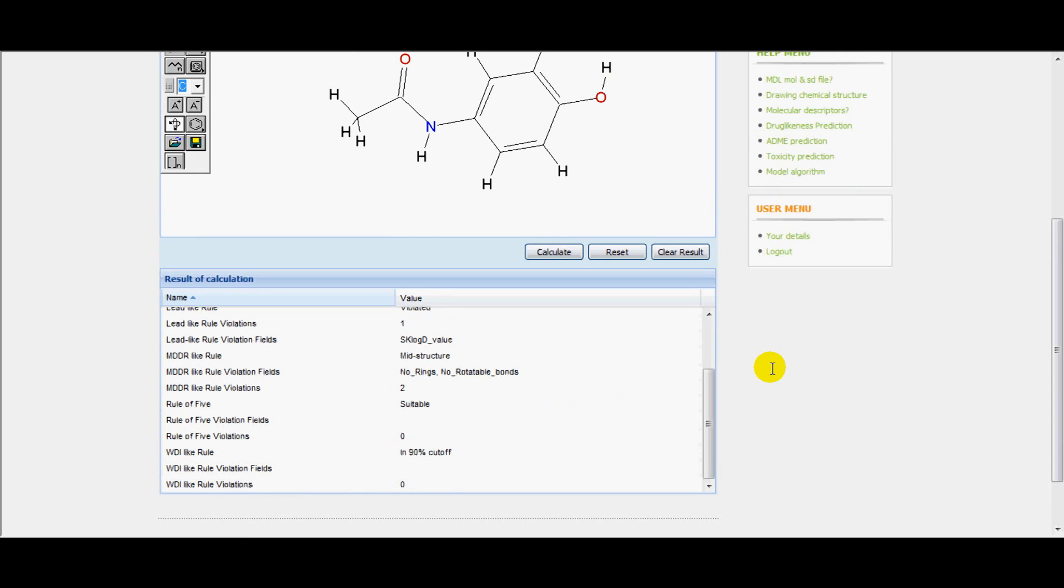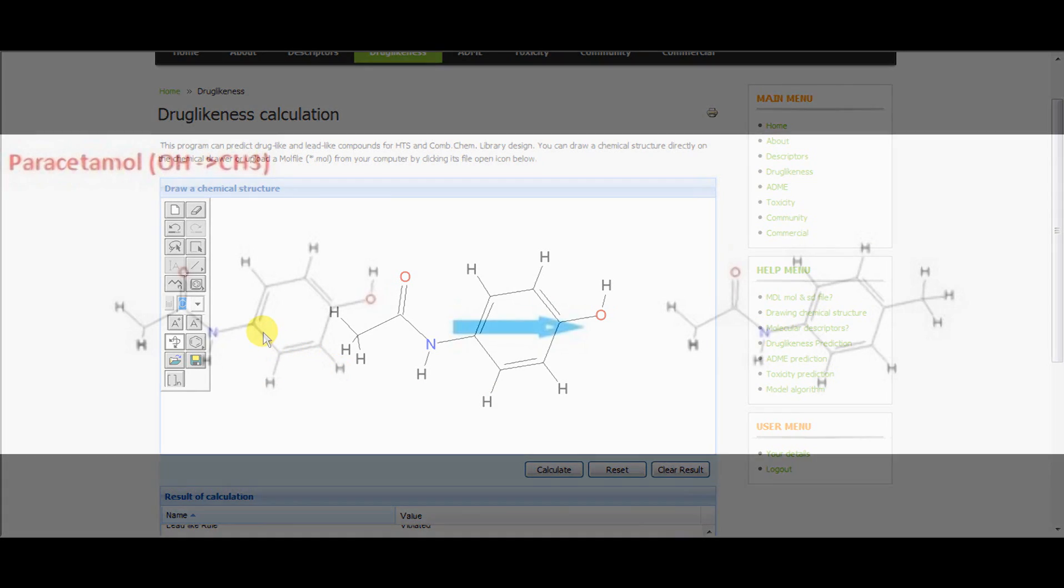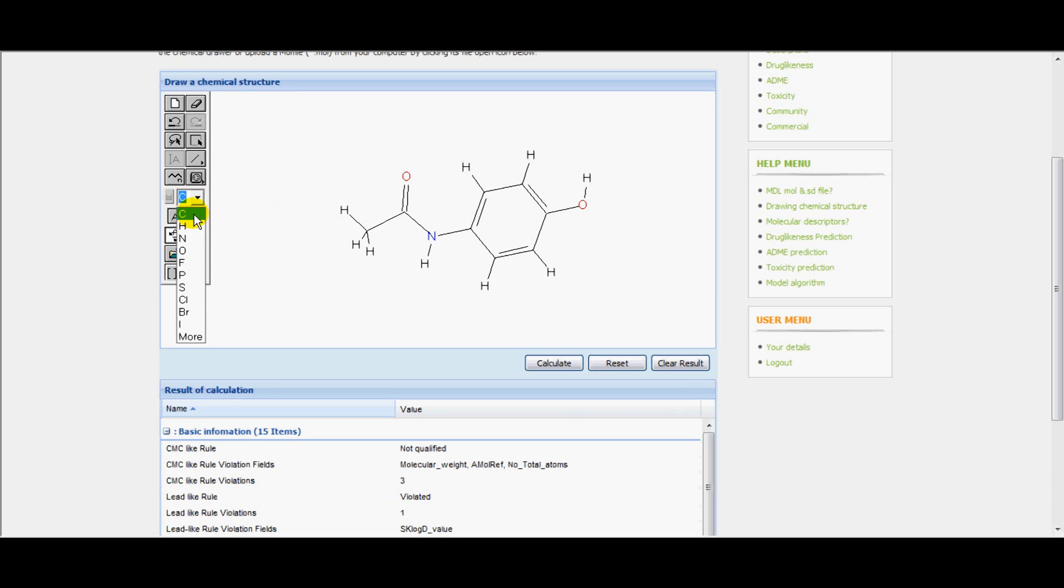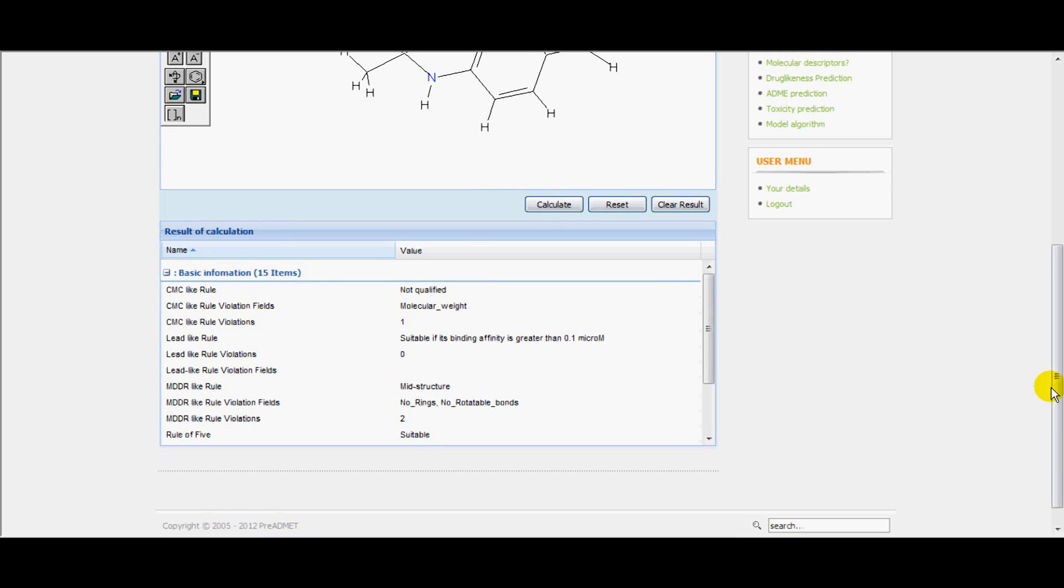Now we can edit the molecule by selecting the atom from the tool panel. Select carbon. Select C for the carbon atom and click on the desired atom to substitute it with carbon. Here oxygen is replaced with carbon. We can draw the hydrogen to view the valency of carbon. The program itself will fill the valency automatically. Now OH sidechain is substituted with CH3. Then calculate the drug likeness prediction. Analyze different rules, number of violations in each rule and copy the result to the document.